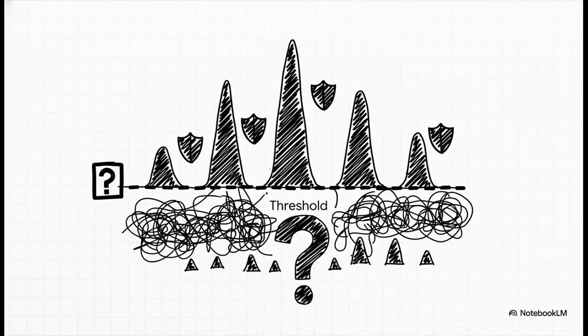Ultimately, all of this troubleshooting comes down to one core principle in forensic science. Reliability is defined by thresholds. We use things like analytical and stochastic thresholds to make objective, numerical decisions about our data. This whole systematic approach is what allows us to separate a true biological signal from all the random noise and artifacts that pop up at the edges of detection.